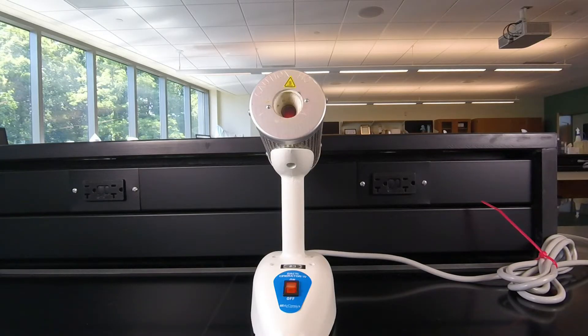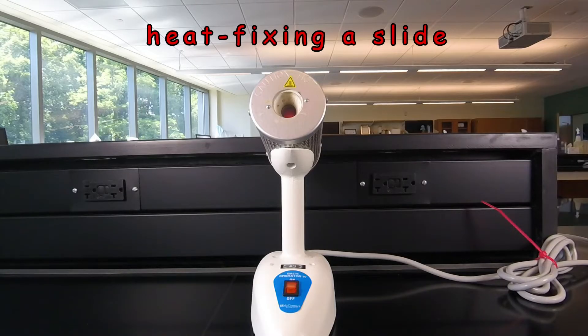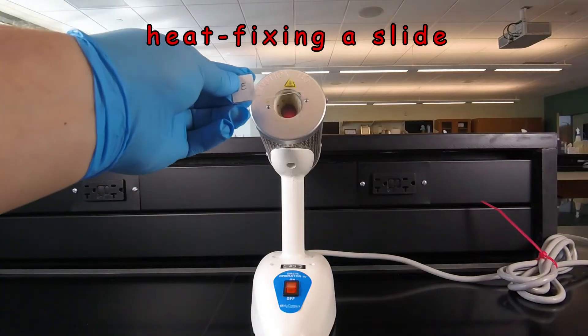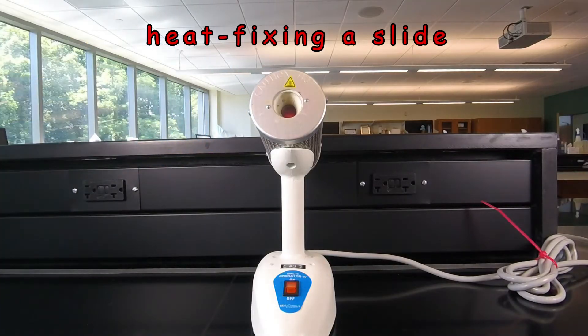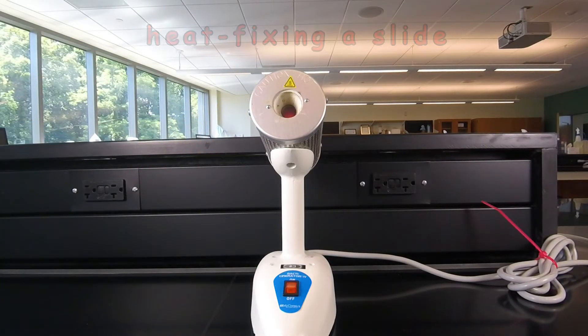Now that our slide is air-dried, we're ready to fix the bacteria to the slide so they don't wash off. In this video lesson, I'm going to show you how to do heat fixation, where we'll hold the slide against the opening of a Bacti-cinerator. The heat will coagulate the protein in the bacterium, causing it to stick to the slide.